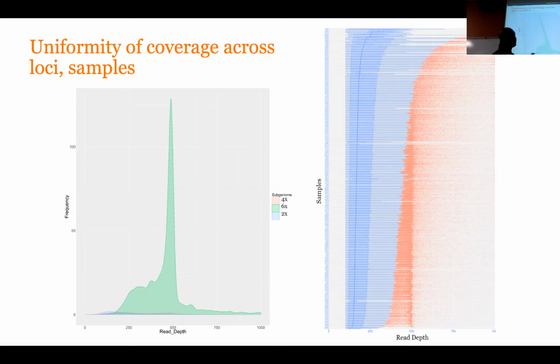And things you genotyped at 2x pop out at about 100, 125, right? Which sort of scales, as you'd expect from 1 to 6, right? And then the pink stuff is slightly shifted, which you'd expect to be 2 times the copy of a 2x, right?